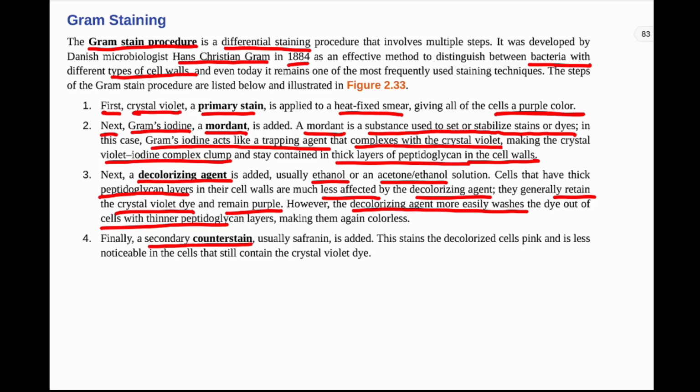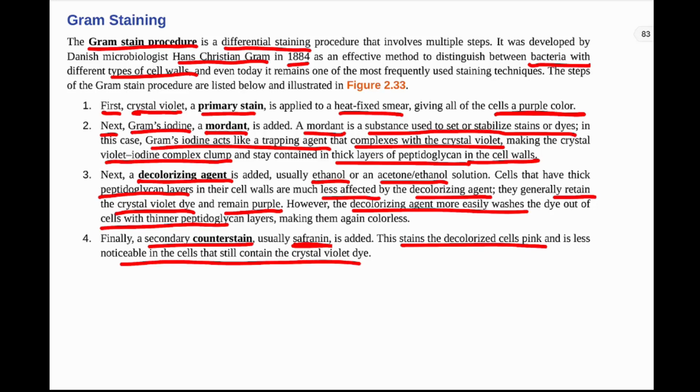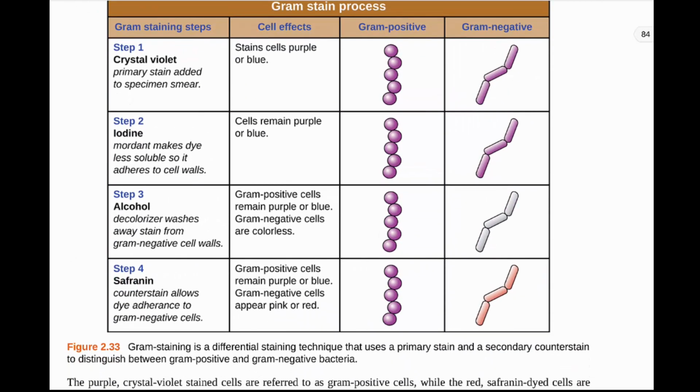Then we have our secondary counterstain, and this is usually safranin when we do gram staining. This stains the decolorized cells, the ones that had the crystal violet washed out. It stains those cells pink. Less noticeable in the cells that still contain the crystal violet. So it's going to stain everything pink, but the ones that have the crystal violet are still such a deep dark purple, you can't really tell that there's any pink added. So it's going to stain the other cells pink. So in this case we end up with cells that have a thick peptidoglycan wall are purple from the crystal violet, and those that have a thin peptidoglycan wall are then pink.